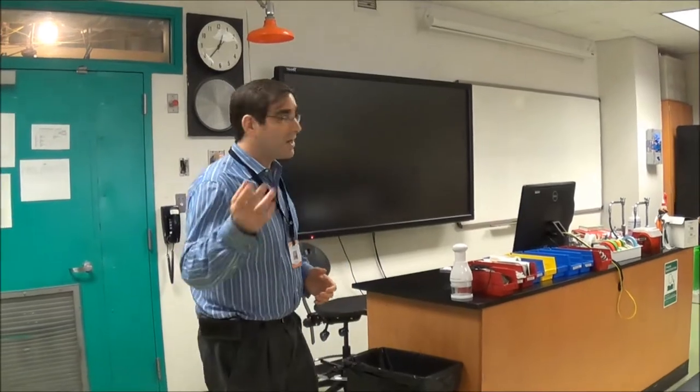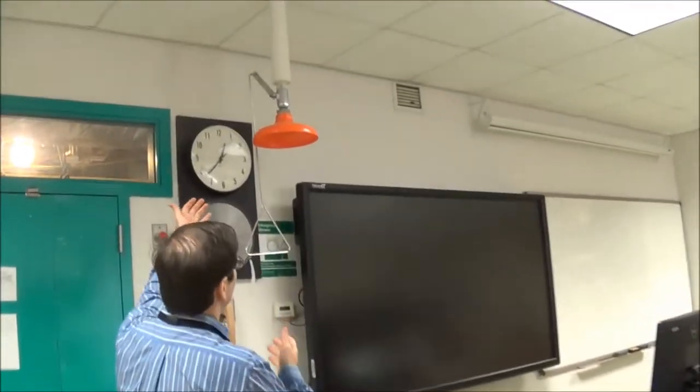This video is going to be somewhat generic — it will go over general aspects of health and safety — but we have ten different lab spaces here at Roxbury Community College. So the safety shower or eyewash station in your lab space may not always look the same as the ones next door. The faculty member teaching your course will go over with you both the location of these pieces of equipment and how to use them, in addition to showing you this video. For example, this is a safety shower.